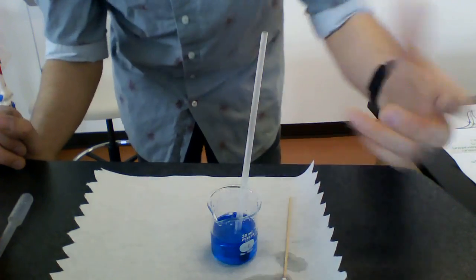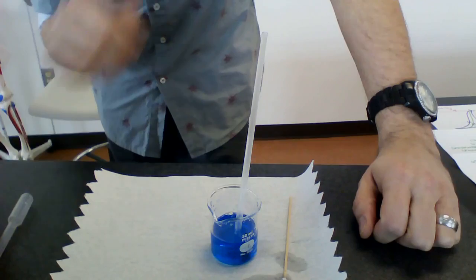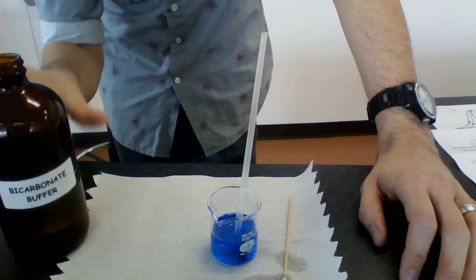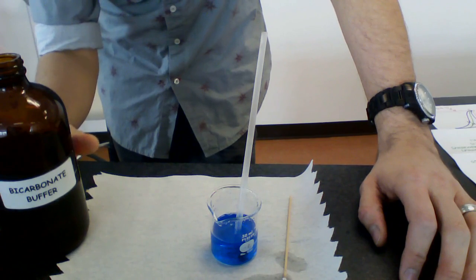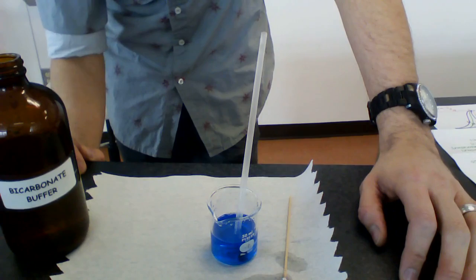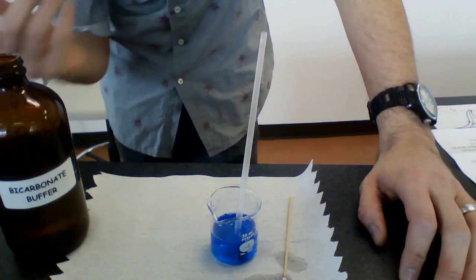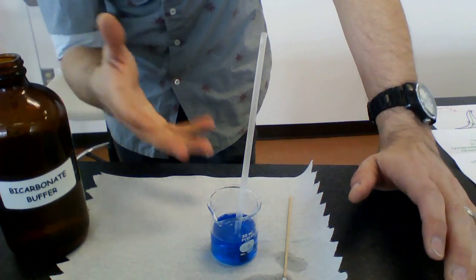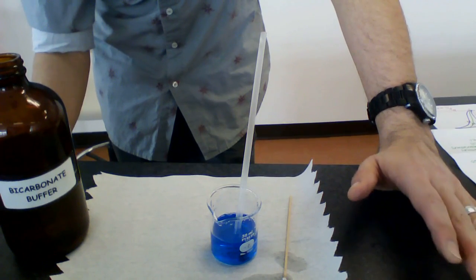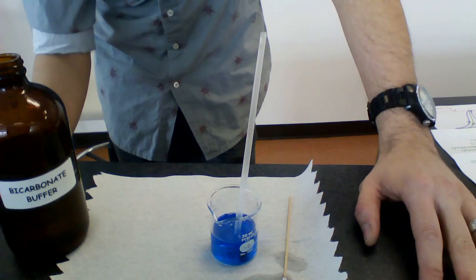And it's not changing. I could do this all day. It's not going to change. And the reason why is because this buffer has an acid and a base, and the base, bicarbonate, basically can absorb all of the acid that I can put in here. And since it absorbs all the hydrogen ion that I put in here, it's not going to change the pH. And so you don't see changes in hydrogen ion, and you don't see changes in pH.